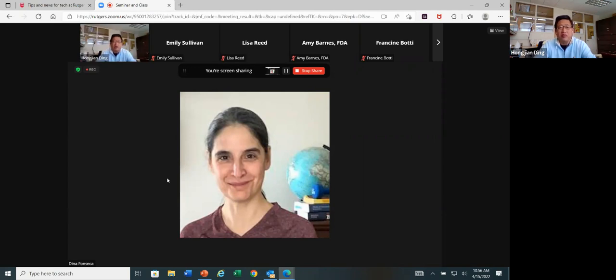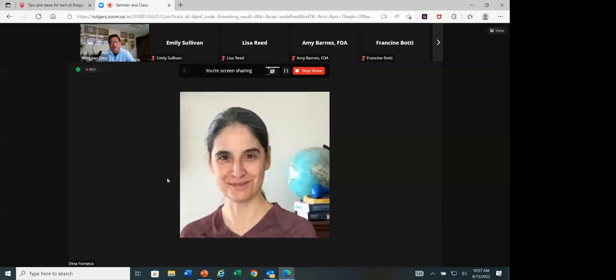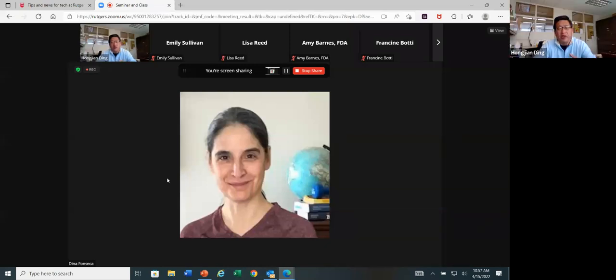But some foods don't have a defect action level. Then the analysts give it class 2. We have a center called the Center for Food Safety and Nutrition, CFSAN, which does a second review, because they have a much bigger picture than our lab.